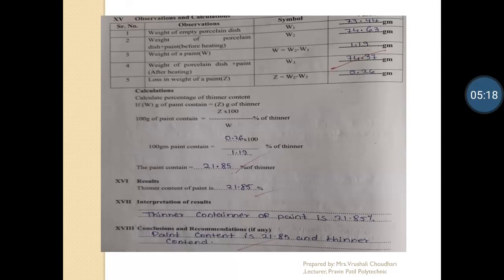After that, heat this porcelain dish in an oven at 120 degrees Celsius. We will observe the third reading, that is W3. From that, W3 minus the weight of the empty porcelain dish gives the solid content in the paint.